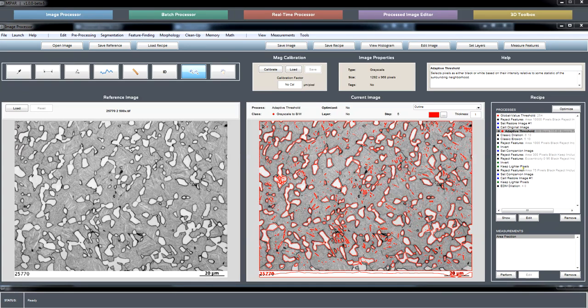Okay, I've spent a fair bit of time on that, but I think that can cover some of the distinguishing different microstructural features. Is there anyone out there that had particular images for distinguishing different microstructural features that they were really hoping would be demonstrated? I have Kim and Rasul down for distinguishing different microstructural features.